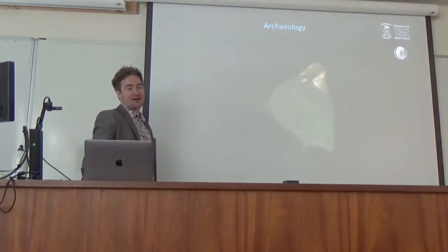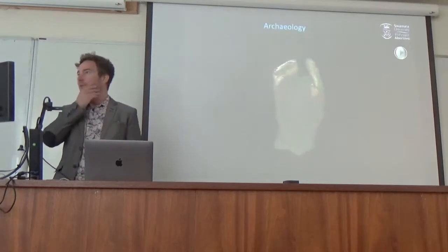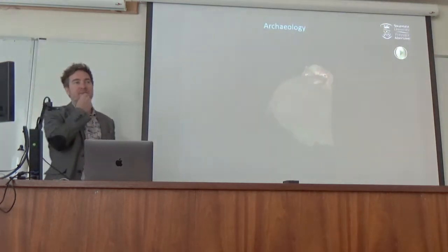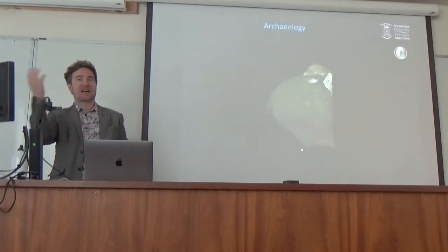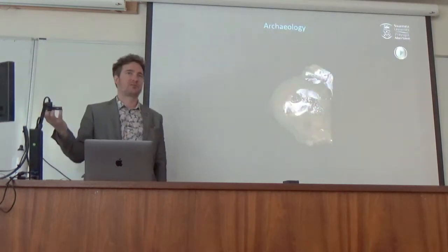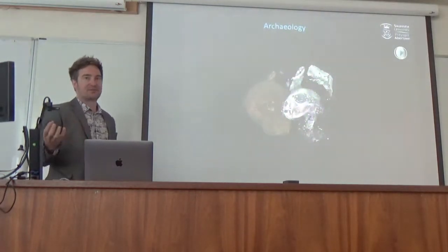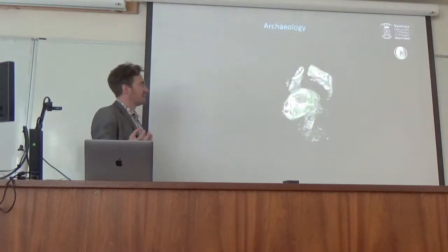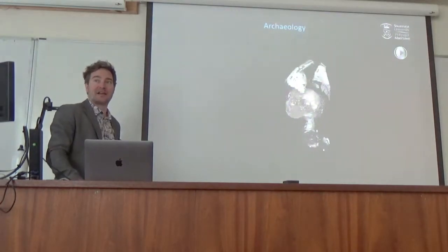We should have that. And then archaeology. This is really nice to talk about, because if you could see out that window, I did close these blinds, that building across there is the Egypt Centre, and that's our Egyptology Museum on campus. I went over there knowing I just had an X-ray machine and that they'd probably have some cool things to look at. This is a long-term research project, one of those side projects, and there's a paper that I just need to finally finish, but there's a lot of research that we've done on scanning their mummified animals.